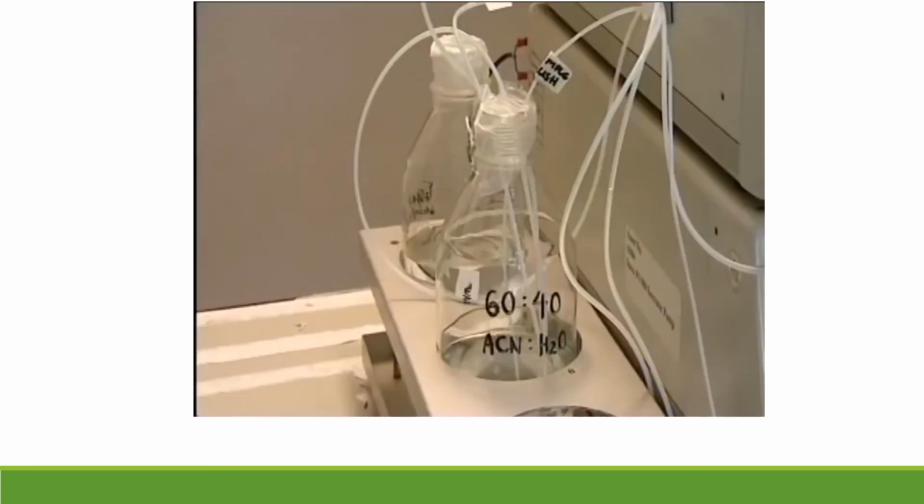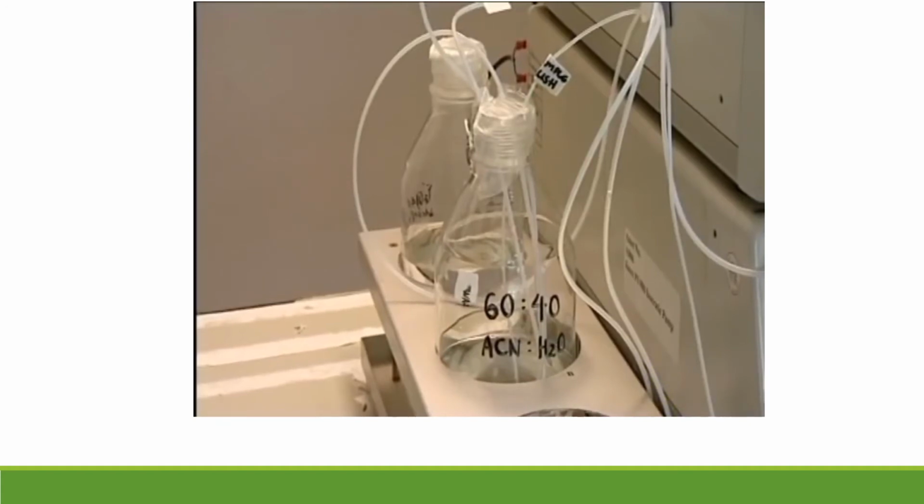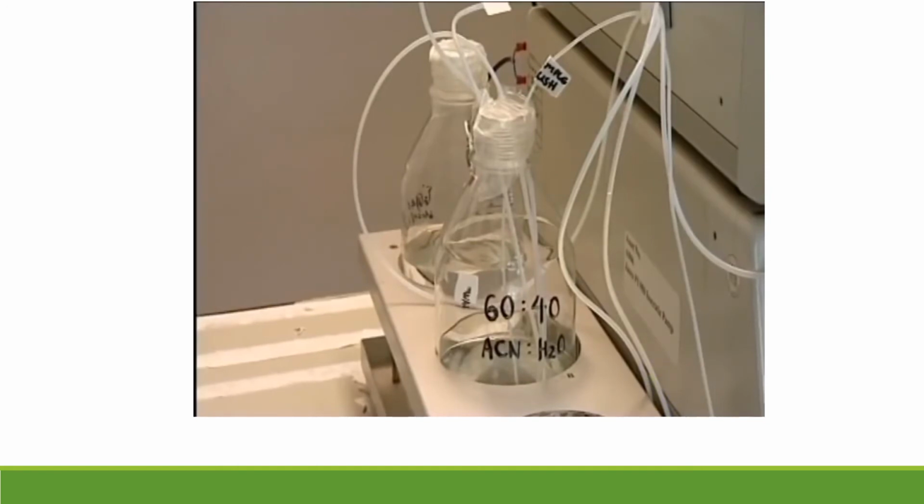These bottles contain solvents. Two solvents can be mixed in any proportions to give a mixture, the liquid phase, of suitable polarity for the separation that is being done. In this case, one solvent is water, very polar, and the other ethanenitrile, less polar. The operator can decide on a mixture with the correct polarity for the separation she is doing.